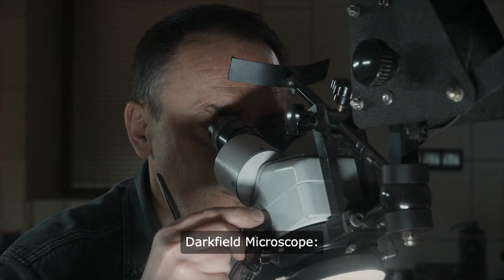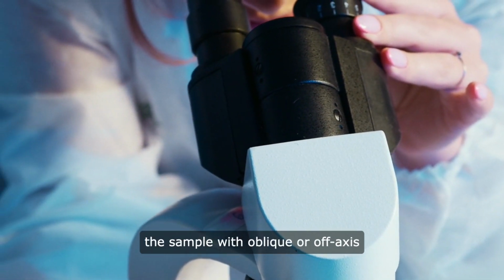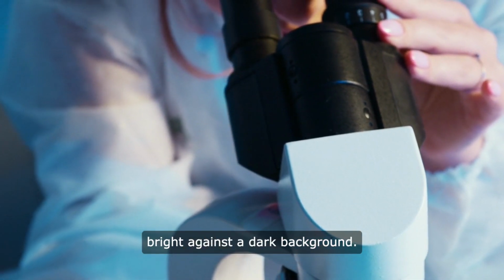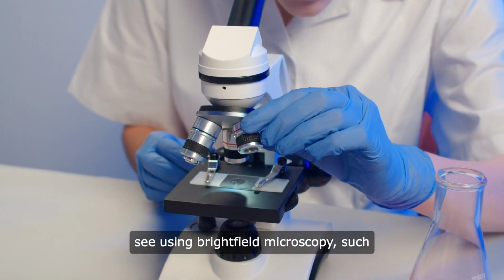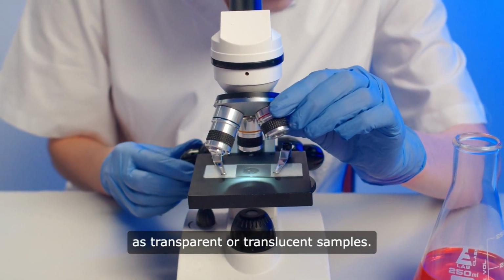Dark field microscope. Dark field microscopy illuminates the sample with oblique or off-axis light, causing the specimen to appear bright against a dark background. This technique is useful for observing specimens that are difficult to see using bright field microscopy, such as transparent or translucent samples.